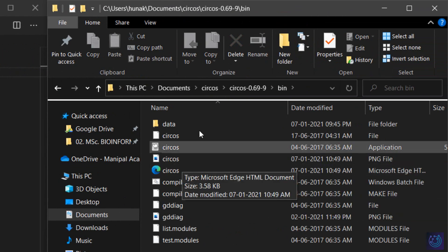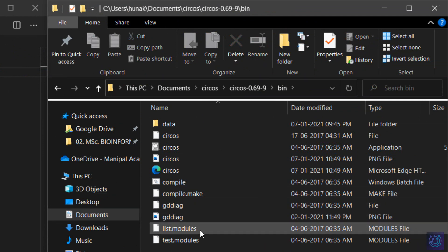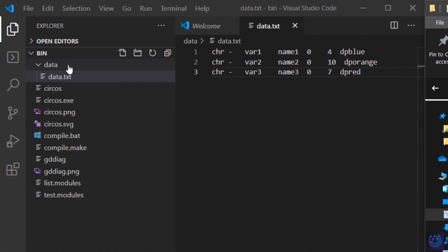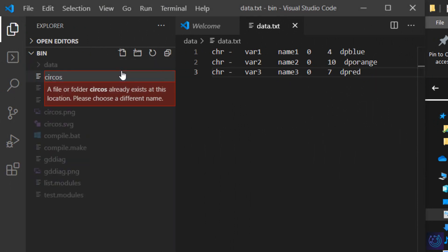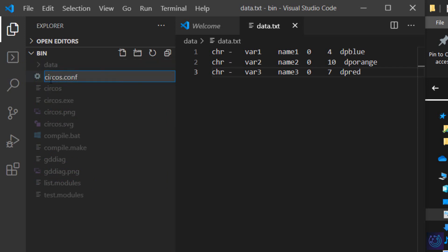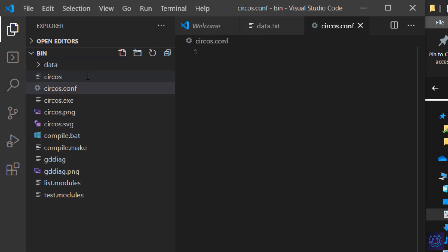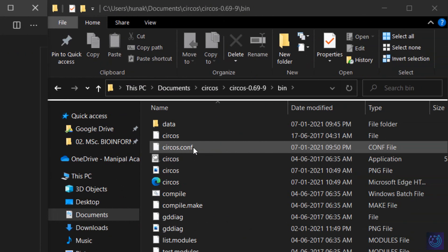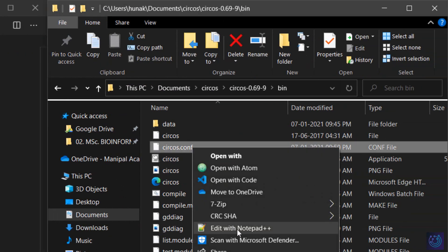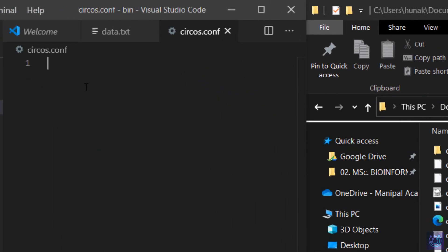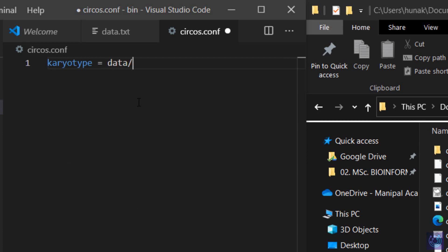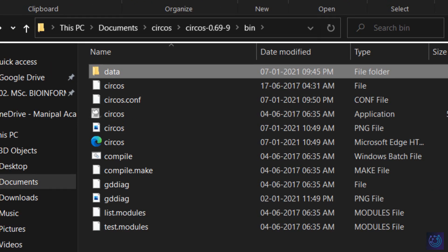Now let's go back to the bin folder. We need to write a configuration file. In the bin folder, click 'New File' and name it 'circos.conf' — the extension should be '.conf', not '.txt', because it's a configuration file. In this file, we first specify the karyotype data, which is in the folder 'data/data.txt'. In the next line, we create two tags: the first is an 'ideogram' tag, and the next is an 'image' tag which will contain the details of the image we generate.